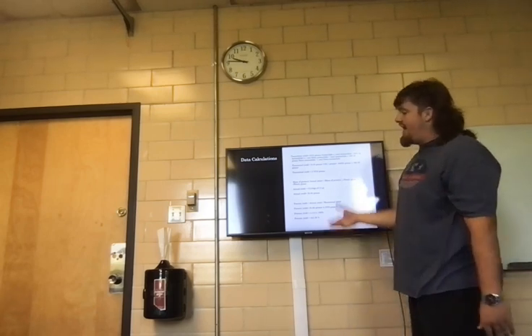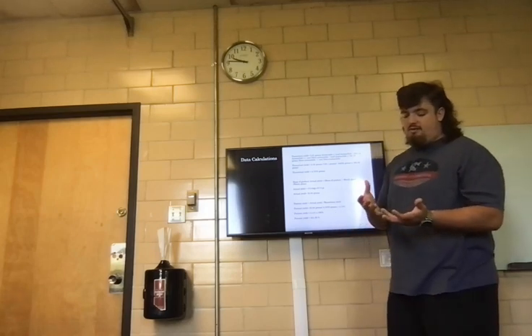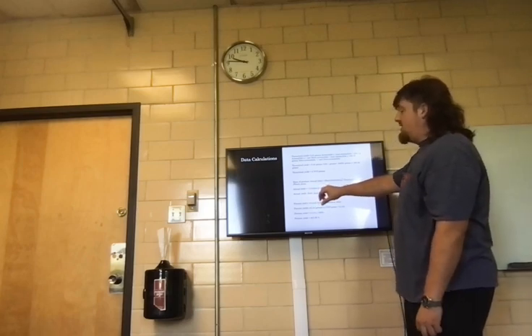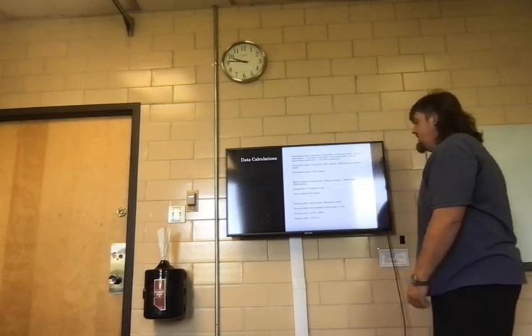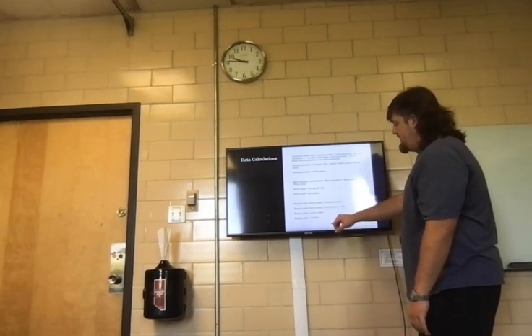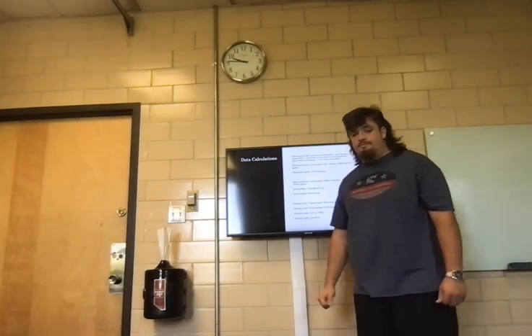To determine how much we actually produced, we took the weight of an empty watch glass and subtracted it from the weight of a watch glass with our product on it, as you can see here. This was the weight of a watch glass with our product on it, minus the weight of our empty watch glass. Thus, we produced 35.84 grams. To get a ratio of how these two compare, we calculated our percent yield, which is our actual over theoretical. And what we were left with was 411.58%.